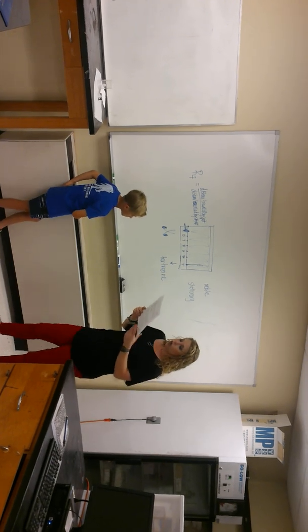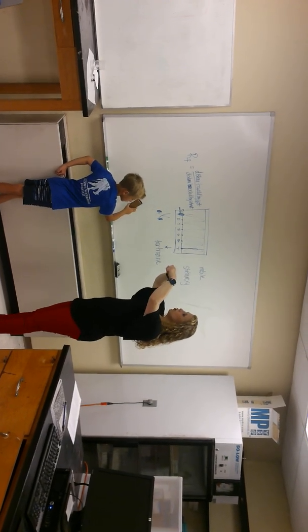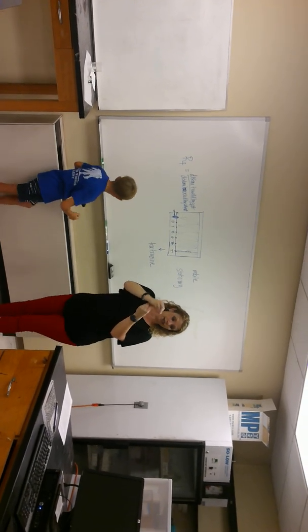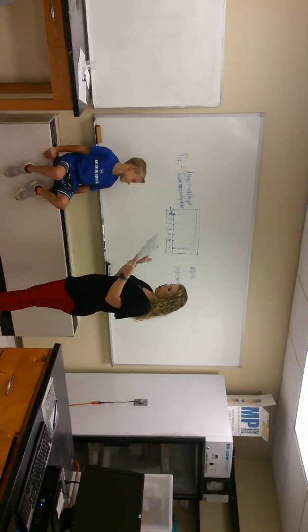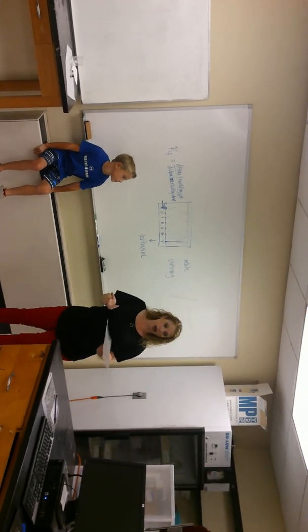Okay, so what you want to do is you're going to get your chromatography paper, fold it around, and staple it. Be sure that the two ends don't overlap. That's also very important, okay? All right, you're going to let it go until it gets close to the top. It says about 1.5 centimeters from the top. That's going to take a little while.